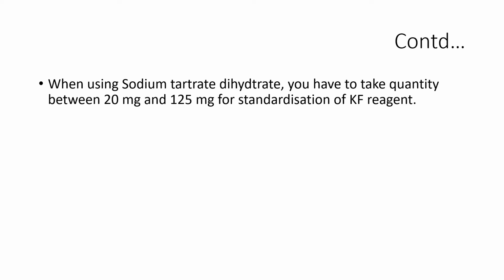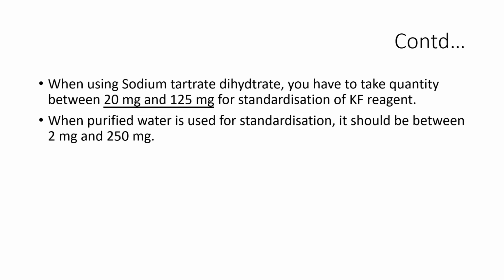Let us see more. When using sodium tartrate dihydrate, you have to take a quantity between 20 mg and 125 mg for standardization of Karl Fischer reagent. So it is recommended to take 20 milligrams to 125 milligrams of sodium tartrate dihydrate for determination of Karl Fischer factor. If you use water, it should be between 2 mg and 250 mg.